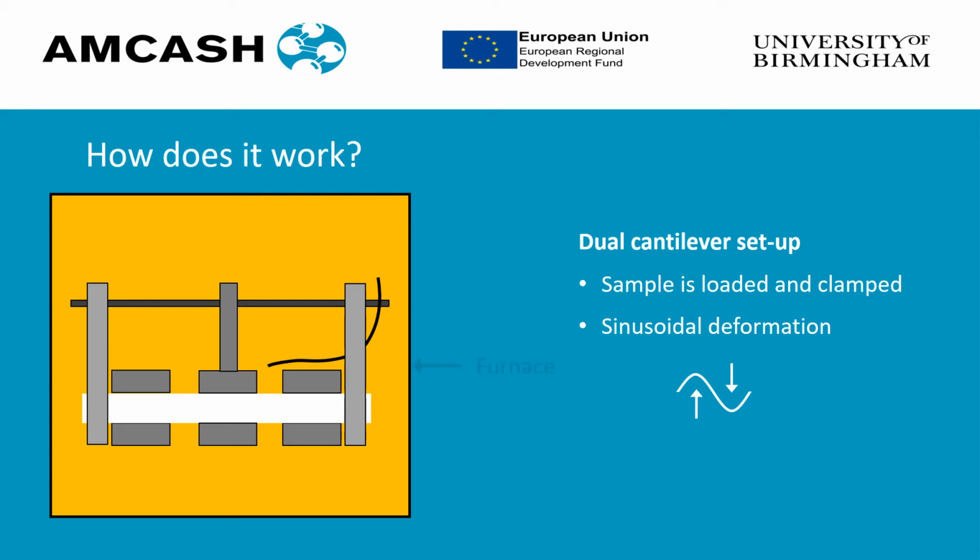As testing takes place inside an insulating furnace, liquid nitrogen can be used to lower the starting temperature, and the temperature can be raised up to 600 degrees C. A thermocouple is used to monitor the temperature as it is increased during the run.